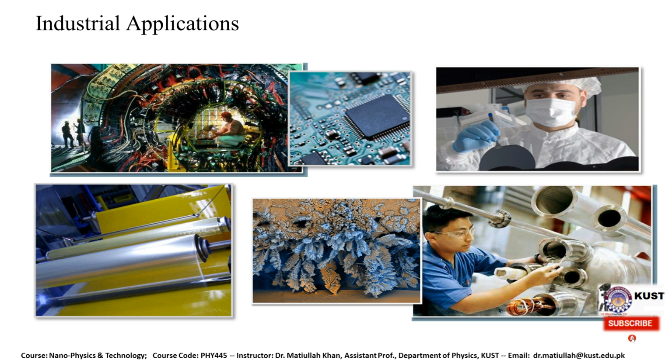How can we improve the performance of materials? We need to know the structure-property relationship. We get information about the structure of a material with the help of electron microscopy. Once we can engineer the structure of the material, or change the atomic positions, we can manipulate the properties of the material, and that is why we are getting new materials with high performance and good properties compared to the old ones. And that is only possible with electron microscopy.